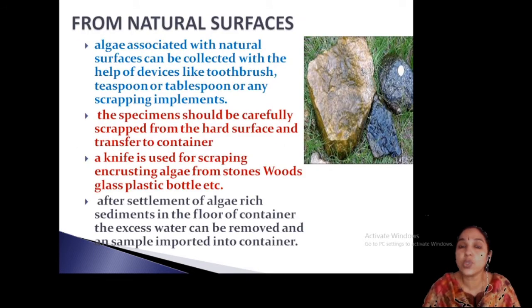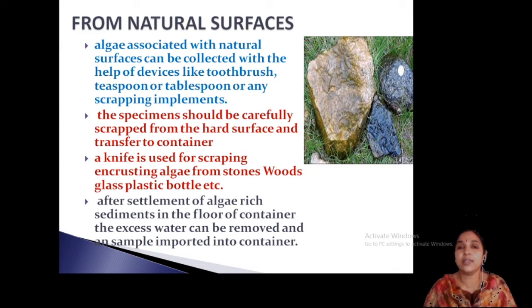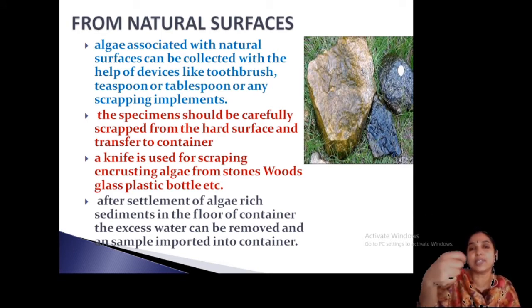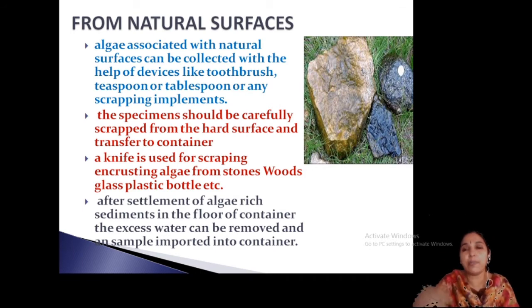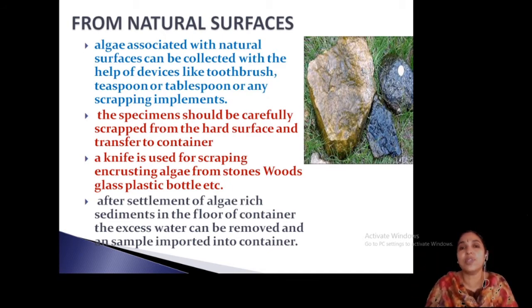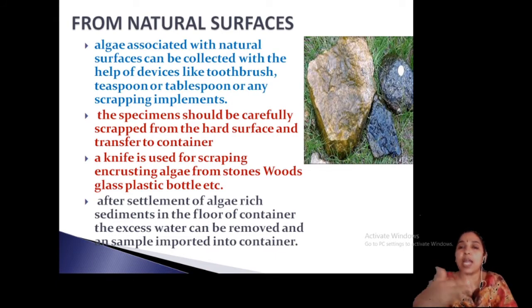From natural surfaces, algae are growing on pebbles, stones, and marbles. You can collect it by using devices like a spatula, teaspoon, or toothbrush to scrape it from the surfaces. Collect it and carefully transfer it to a container — you can use a plastic container or a petri plate. Scrape it from the surface and transfer into the container. Usually a knife is also used for scraping.